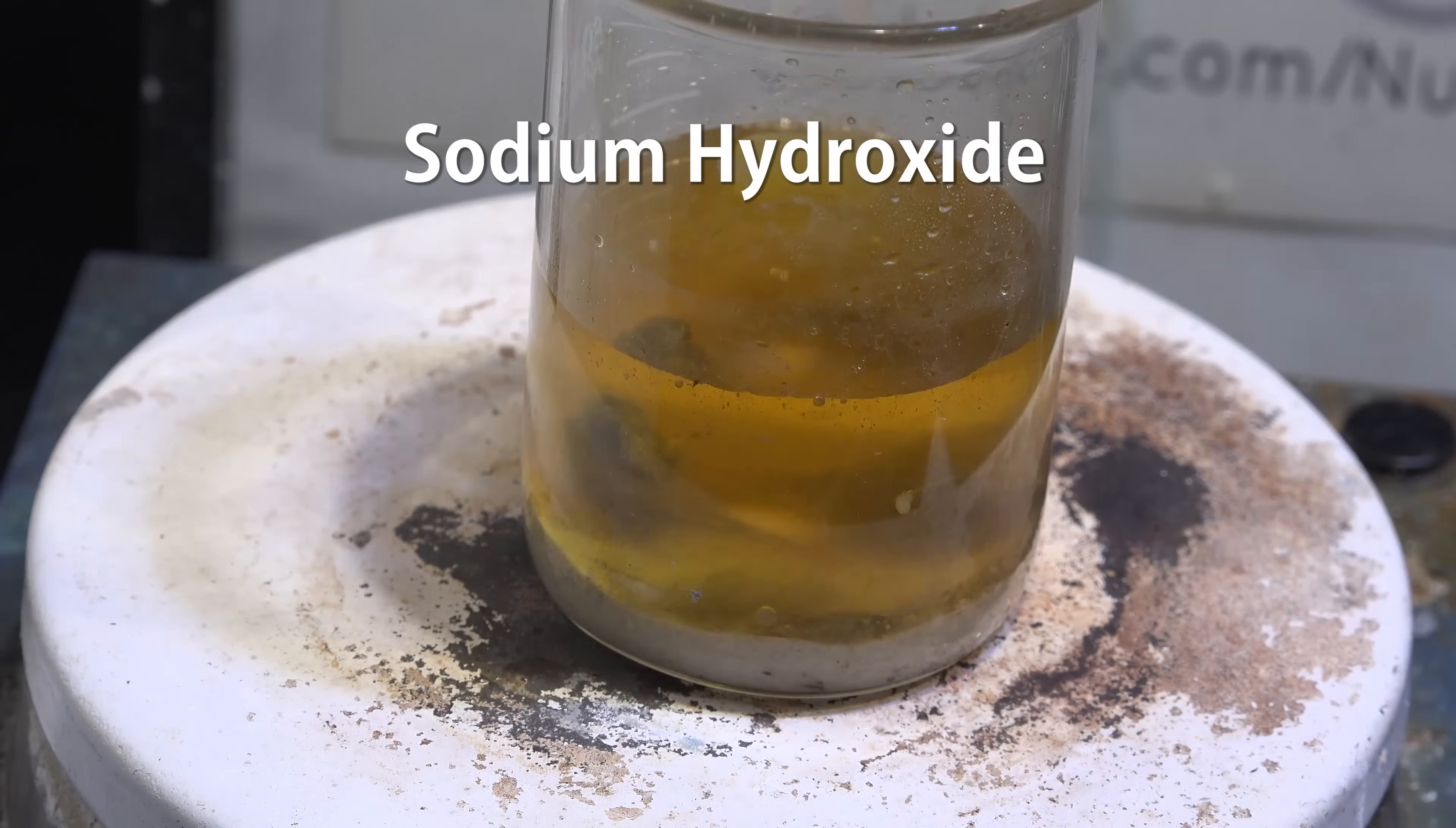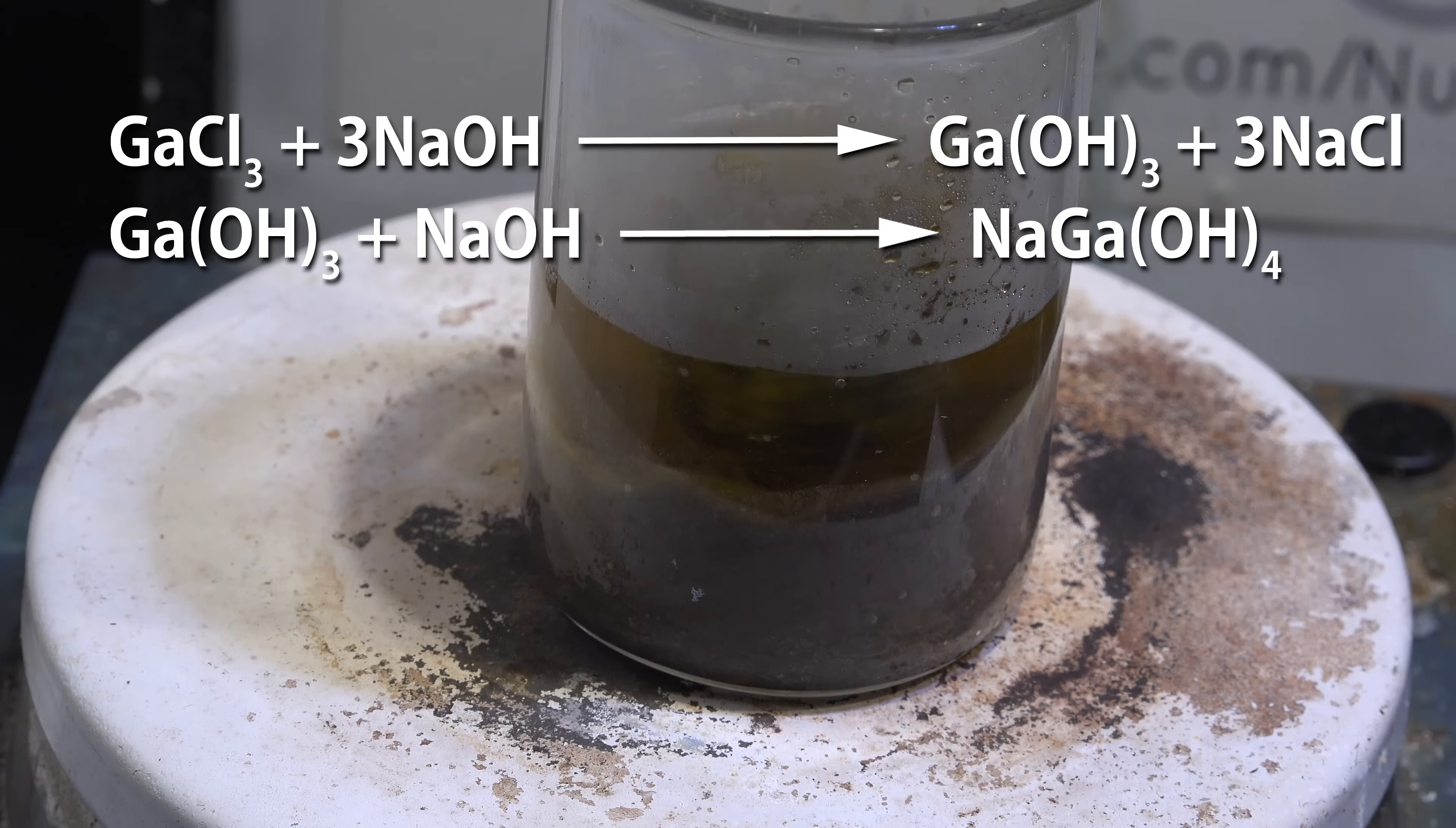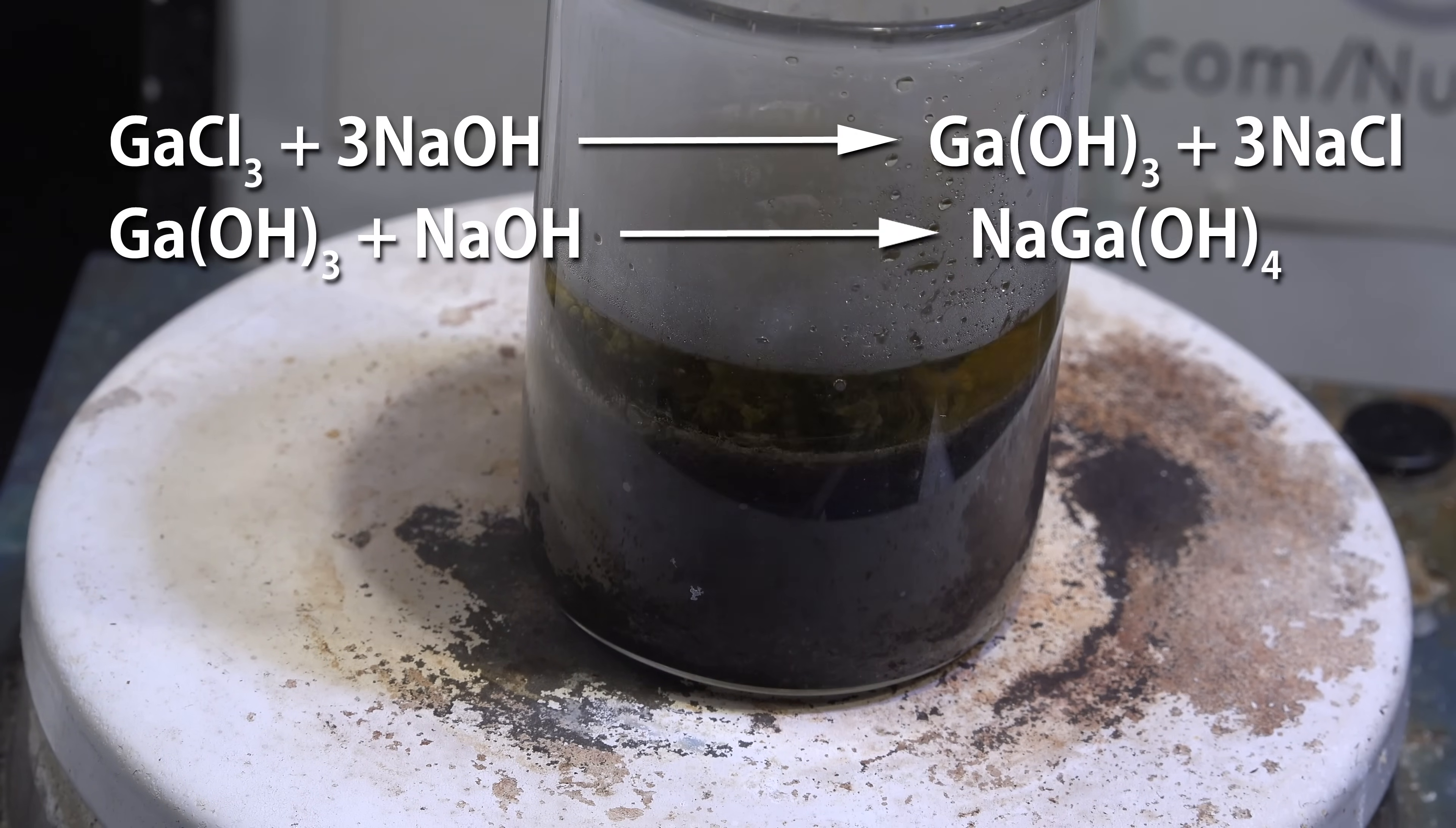Now add in small amounts of sodium hydroxide, about 5% of the solution mass at a time. At first it will form a precipitate of gallium hydroxide.